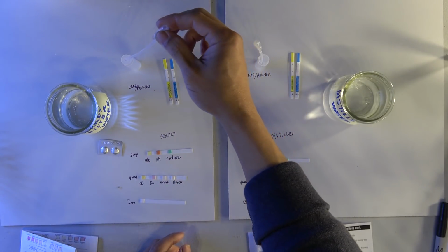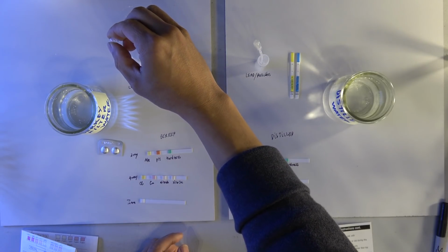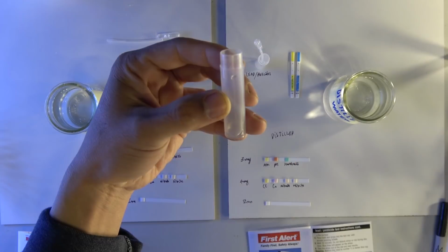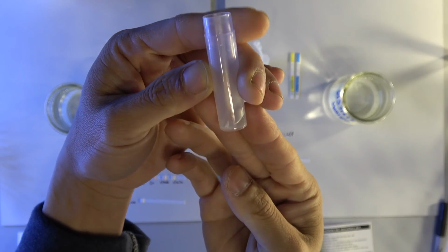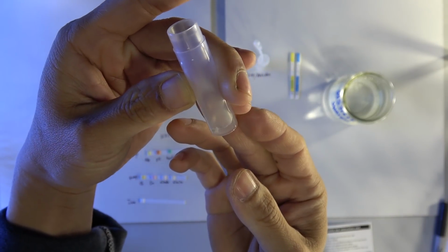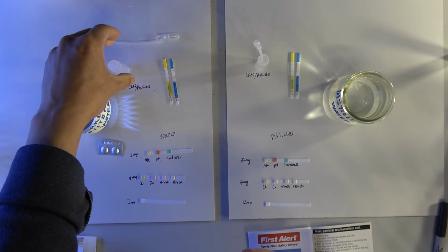Okay, now I squeeze it in here. That's it. That's all of the water that you need for this test. It's not much at all. Just a little bit. I would say about half a cc or even less.